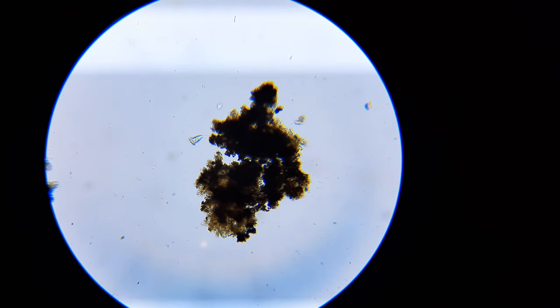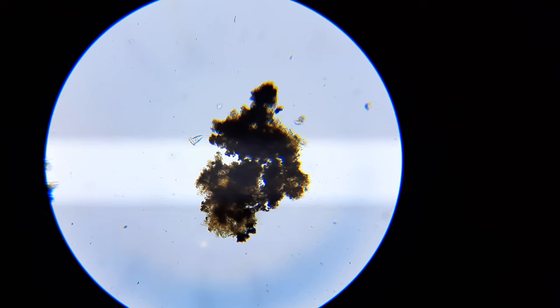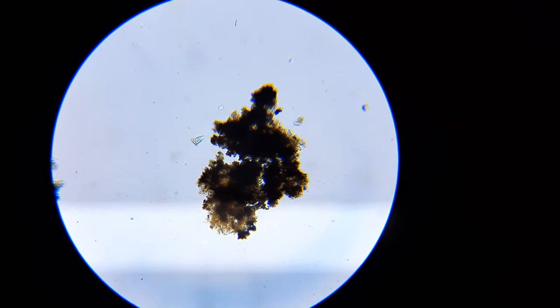The water is living water—it's alive, as you can clearly see. There's an abundance of vorticella in our toilet tank. Okay, take care!